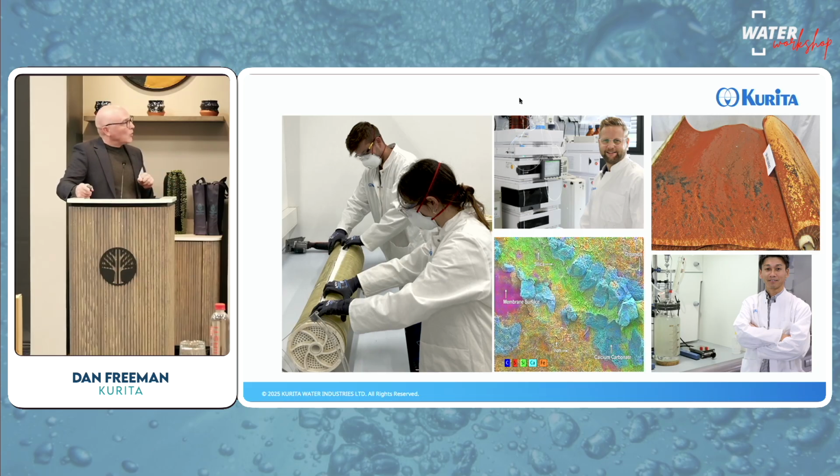And you can see what exactly is there. One of the most useful techniques that we have in the autopsy is what we call chromatic elemental imaging. So you can see the colorful image there in the center of the screen. That's an advanced technique similar to SEM microscopy, where we can look at the membrane surface and understand the distribution of elements across the surface. It gives us a lot more information in terms of what's on the membrane surface and how it's deposited.